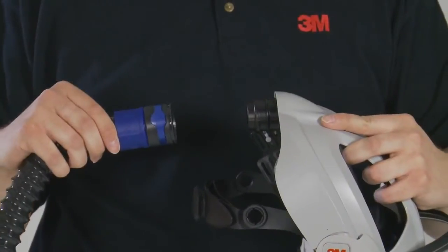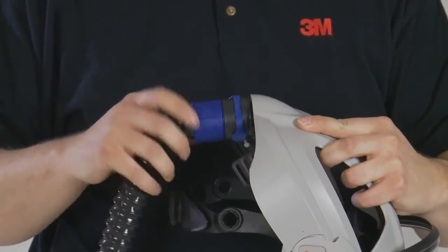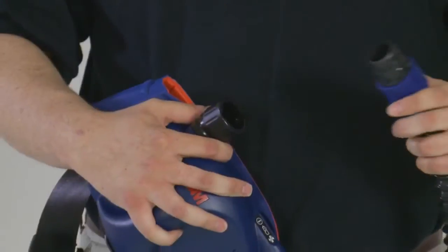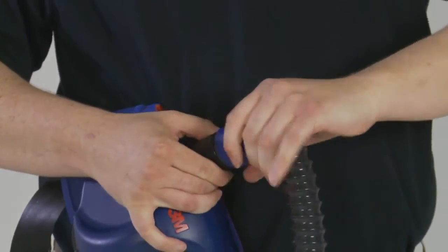Select the appropriate breathing tube for your application and connect the top end of the breathing tube to the head top via the simple quick release and swivel connection. The quick release and swivel connection minimises loops and kinks in the breathing tube.